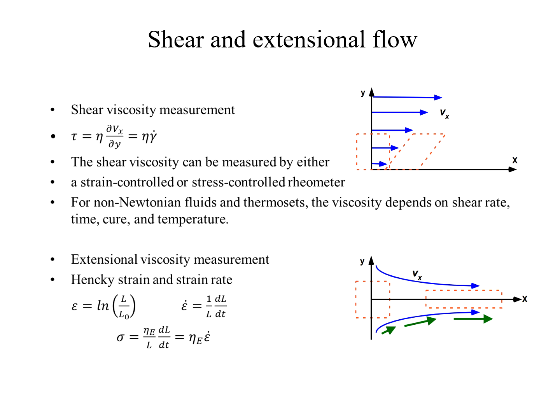Extensional viscosity measurement, as shown in the bottom right figure. Hencky strain and the strain rate can be expressed by the following two equations. The extensional stress is equal to extensional viscosity multiplied by extension rate.